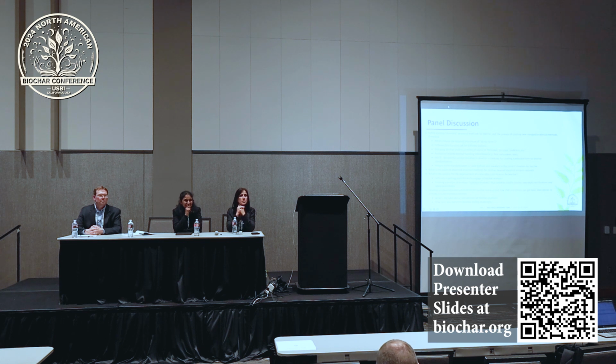Lalitha and I were actually discussing this earlier, but extractable nutrients are really difficult to predict for different soils. So I just wanted to know what you all think about the current extractable nutrients methods, the 1 molar HCl for calcium, magnesium, and sulfur, and the 2% formic acid for phosphorus. How real world relevant are these extractions, and are they really any better than just doing a total nutrient analysis?